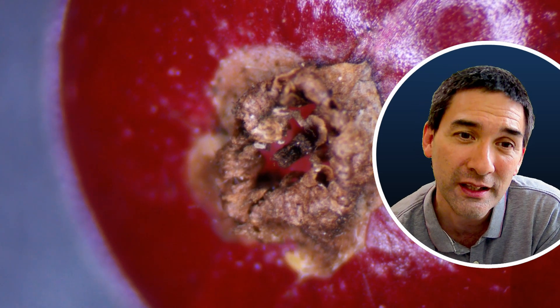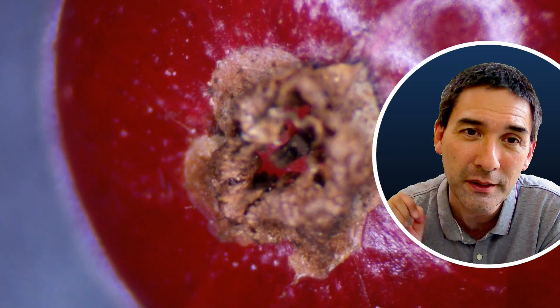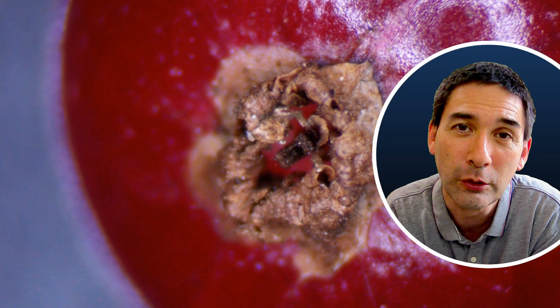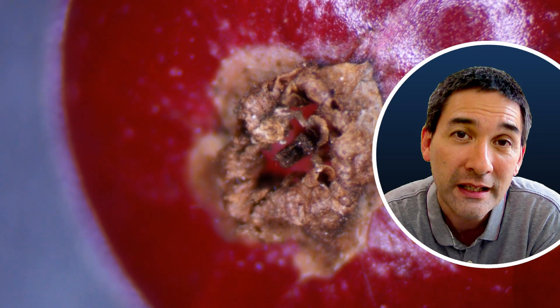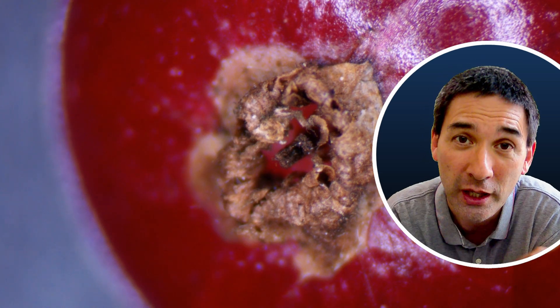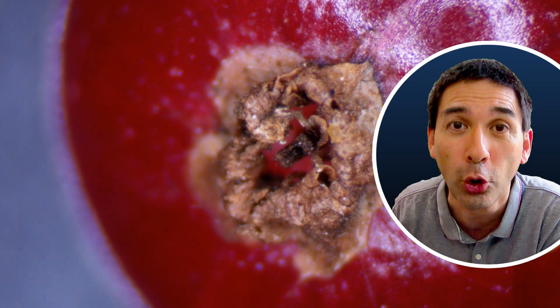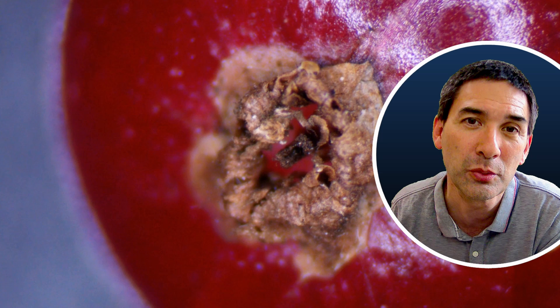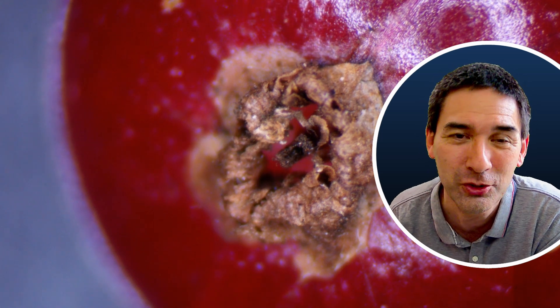Over here on the edge, this is basically where several of them started to hide. There was a little opening in the berry and this is where they started to crawl in. I also noticed they seemed to move away from the microscope light — as soon as the light shone from the top, they immediately started to run away to the opposite end of the berry. So it was a little difficult to chase them around.